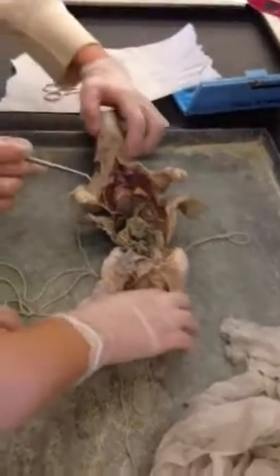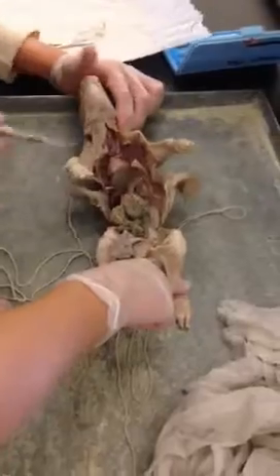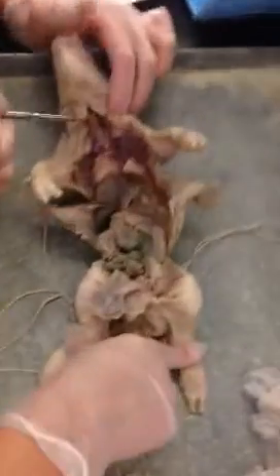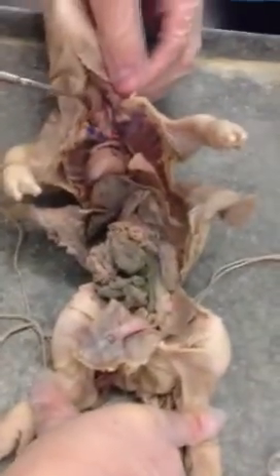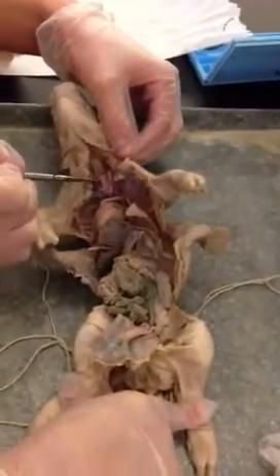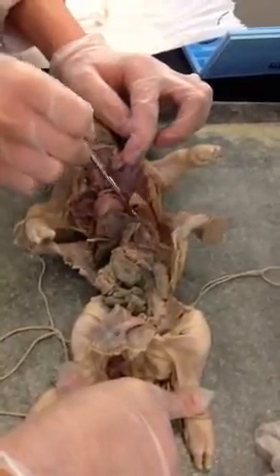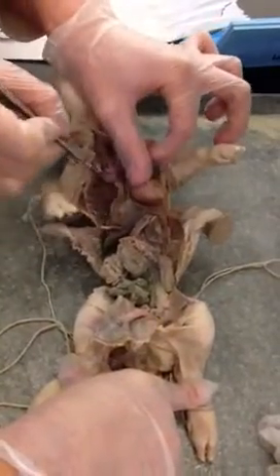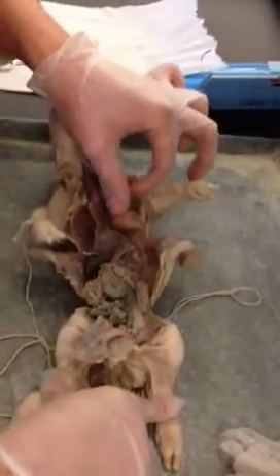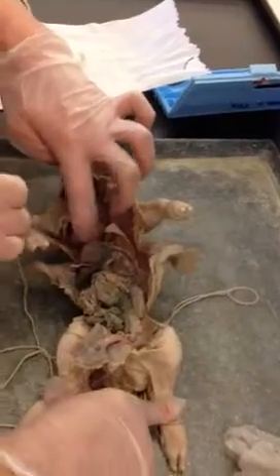So now we'll go through the respiratory system of the fetal pig. The first part is the larynx, which is just like the voice box. So this structure is the larynx right here. So we go from the larynx to the trachea, which we already found was right here. Then from the trachea goes to the lungs, which we again already found. It's these things surrounding the heart. From the lungs we go to the diaphragm, which is that flap sitting just above the liver.